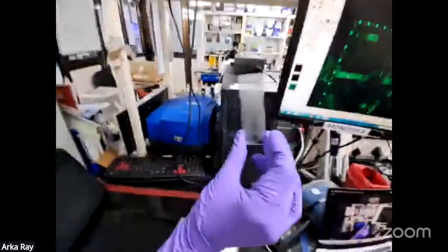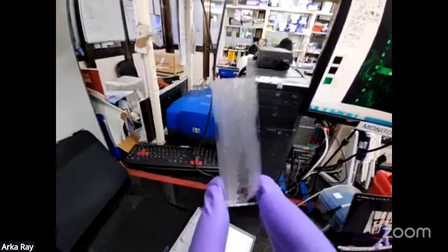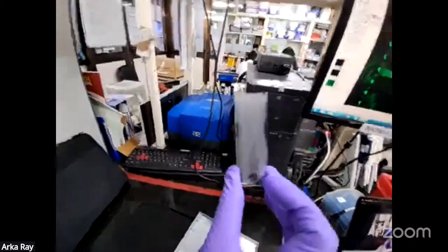So now let us show you this chip. This is the microarray chip. This is the peptide arrays. This needs to be opened.